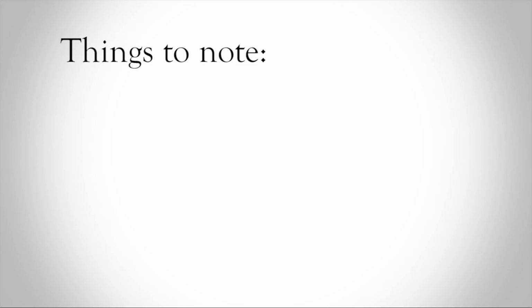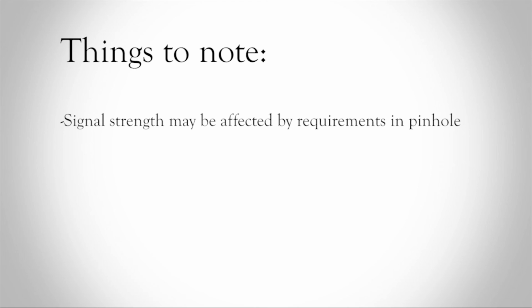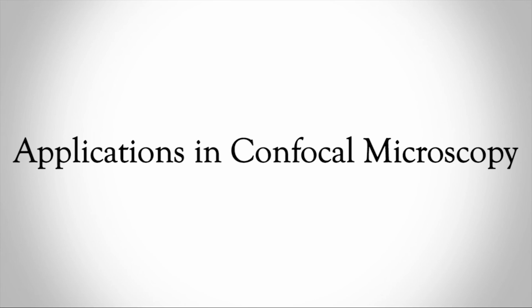However, some things to note when using confocal microscopy is that the signal strength may be reduced by the requirement for a detector pinhole. And since this technique is more labor-intensive, users may require more training and experience to be successful in this technique. Confocal microscopy has several applications.